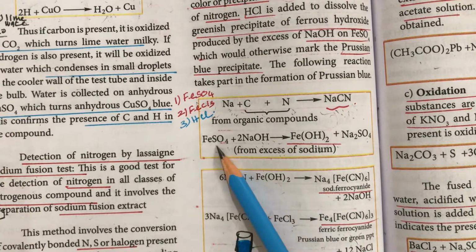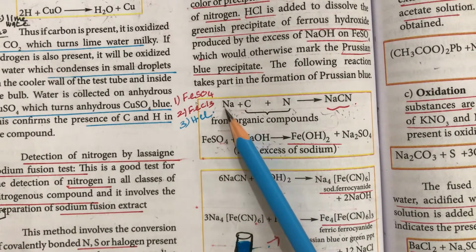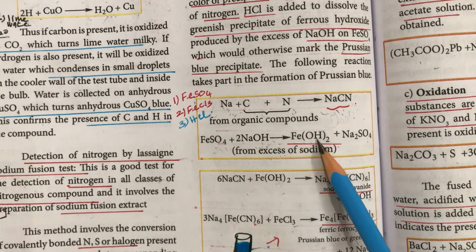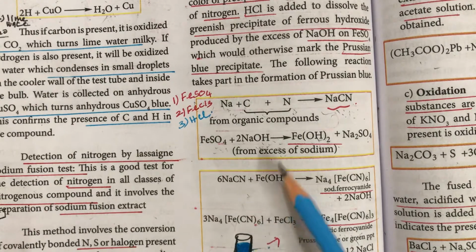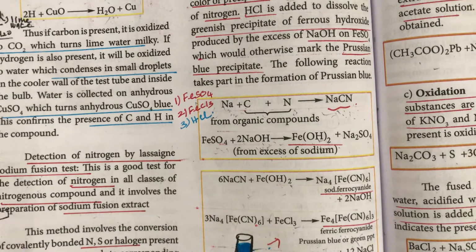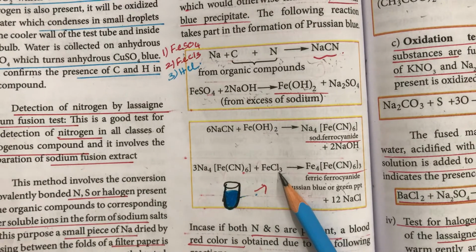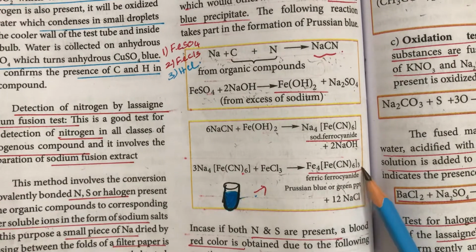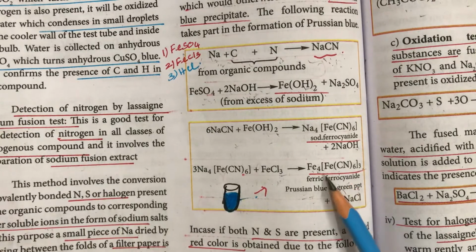To that we add ferrous sulfate. The ferrous sulfate reacts with the sodium hydroxide, which comes from the sodium metal on heating, and forms a green precipitate of ferrous hydroxide. To dissolve the hydroxide precipitate, we add conc. HCl. Next, the sodium cyanide reacts with the ferrous ion and forms sodium ferrocyanide, a coordination complex. To that we add ferric ion. Sodium ferrocyanide reacts with ferric chloride, the sodium is replaced by ferric, and it forms ferric ferrocyanide. The Prussian blue color or green precipitate shows the presence of nitrogen in an organic compound.